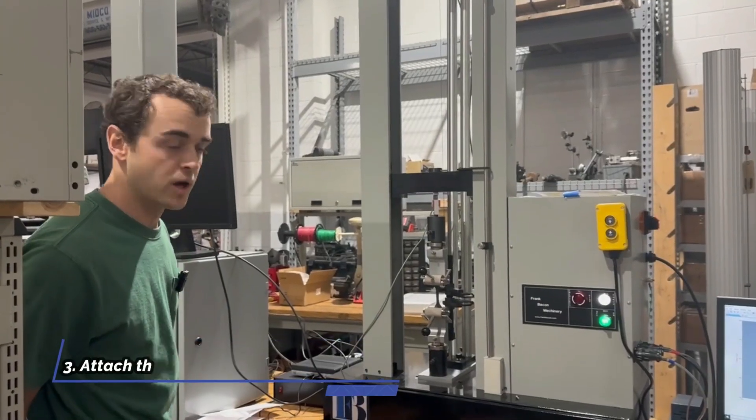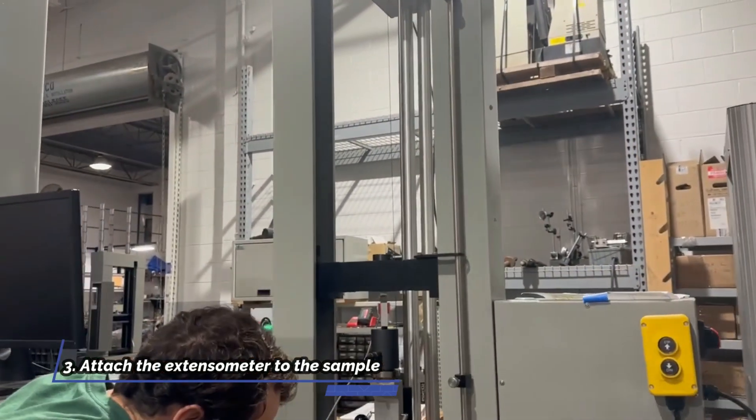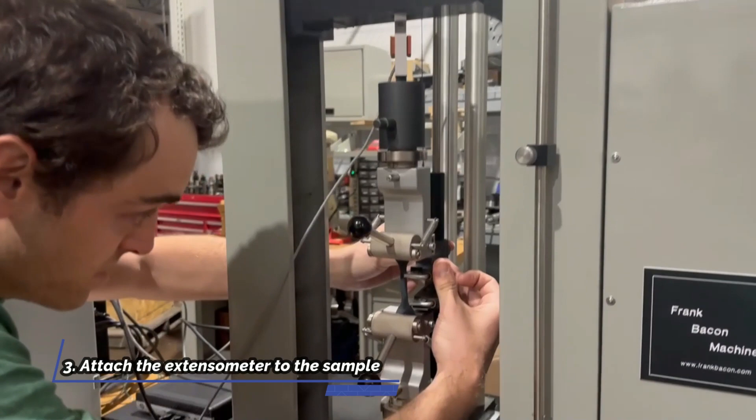Step three is loading up the extensometer onto our sample. Again, this is a long travel extensometer for the high elongation materials.